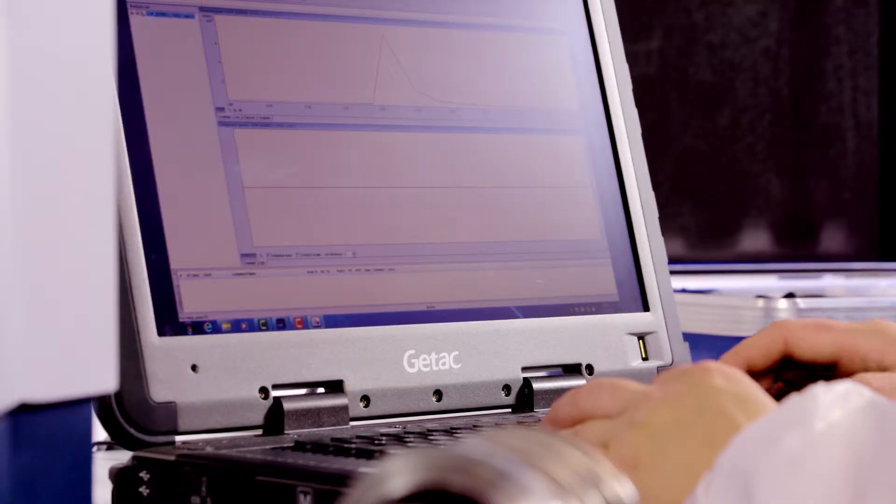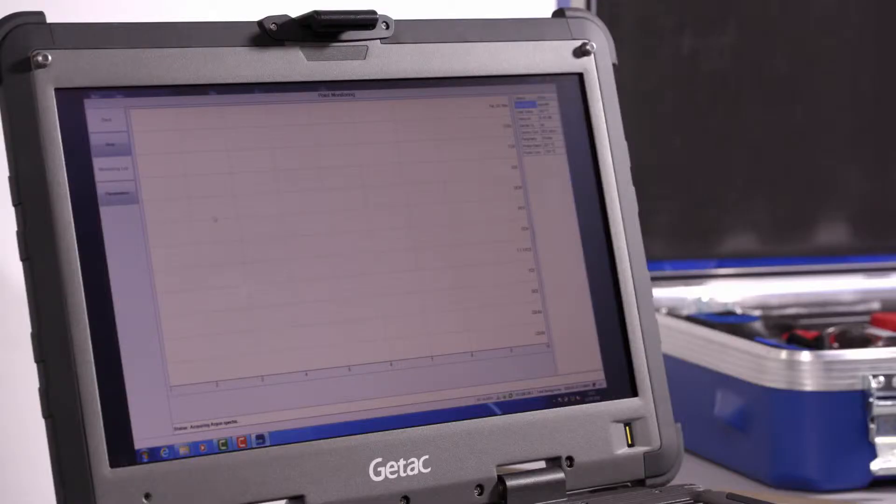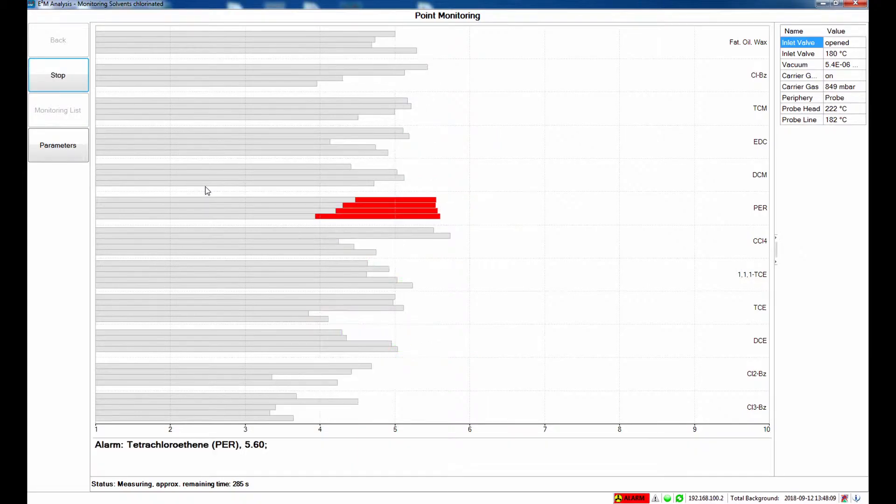The analysis times using E2M are short, ranging from a few seconds for air pollutants with the air surface probe to 20 minutes for a full range GC separation and identification.